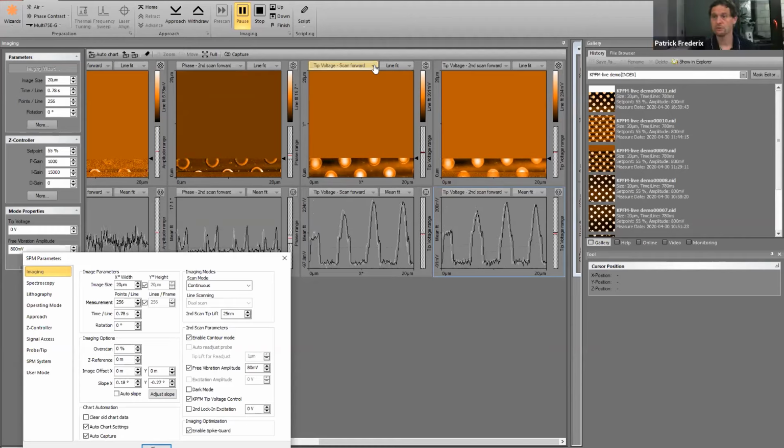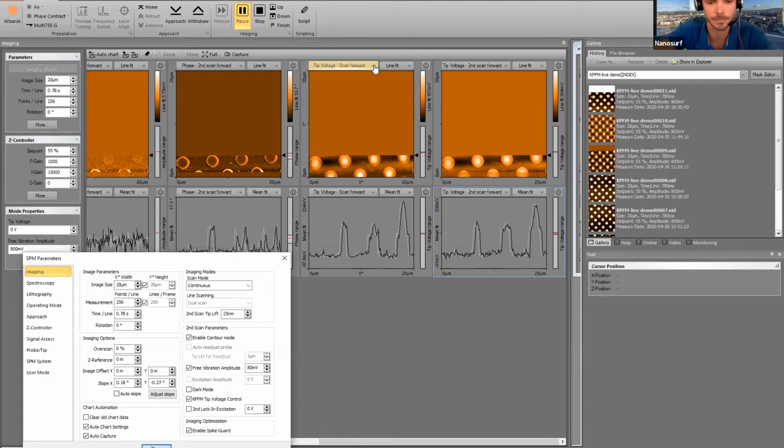So if you want help with setting up a mode, whether it's now the KPFM or spectroscopy or another mode, we have parameter files for many of the modes. And otherwise, we can help you construct one, and just contact us, and then we'll help you together with our local partners to get the parameter files for your setup. That must make things easier.